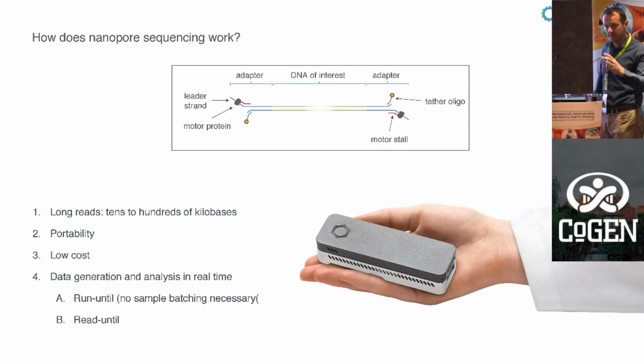And the final thing is that the membrane that the pore sits in is hydrophobic, whereas DNA is hydrophilic. And so the two don't want to interact, but that makes the sequencing very inefficient. So what we have to do is put another piece of DNA with a hydrophobic molecule onto it, so that when that template finds the membrane, it attaches to it and it diffuses in 2 directions rather than 3. This has the effect of making the sensitivity about 10,000 times better than it would have been otherwise.